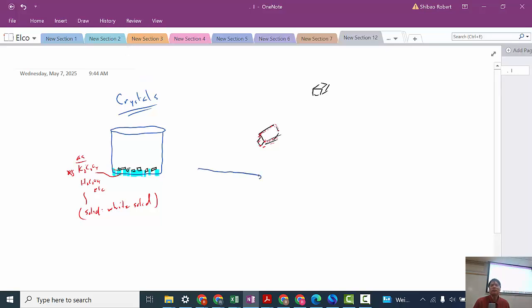If your crystals are small still, then let them grow more. But what we want to do is we want to have big enough crystals so that we can just decant the solution. And then what we're going to do is we're going to wash the remaining crystals. But we're not going to wash it with water, because if we wash it with water, what's going to happen to our crystals? They'll dissolve. So we're going to wash it with 95% ethanol. A little bit will dissolve, so we might lose some of the edges and some of the corners a little bit, but not too much, let's hope. And so we'll wash it with 95% ethanol.